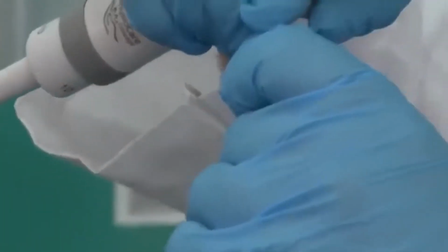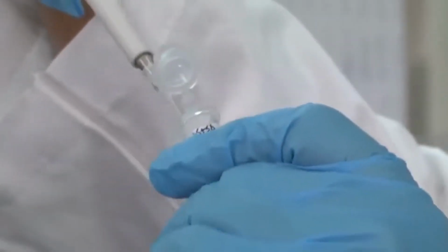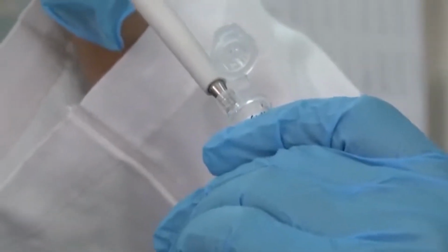The DNA I can take out, and it was stored in minus 20 earlier, but it has already thawed. So, what I am going to do is I am going to take 1 microliter of the ligation product, and since you are working with small volumes, always check visually whether you have actually taken out 1 microliter or whether you are just taking up air.